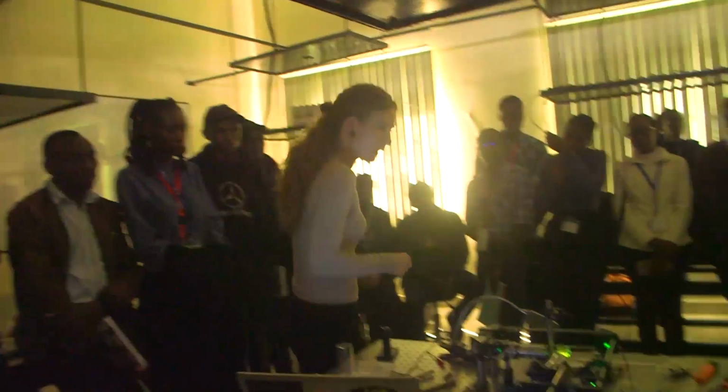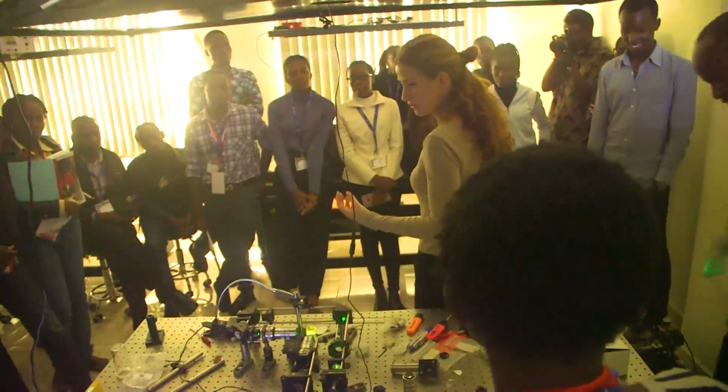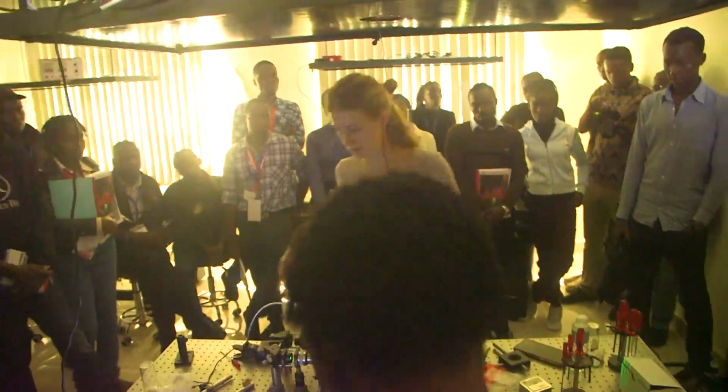Okay, so let's say that I've done things properly, and indeed we can switch off the light and say, okay, so I put here my light sheet, and now I have to look at something. So I want to look through the camera. Okay, the first thing, you can come. I think that everybody should go that way, so that you can see on the camera.